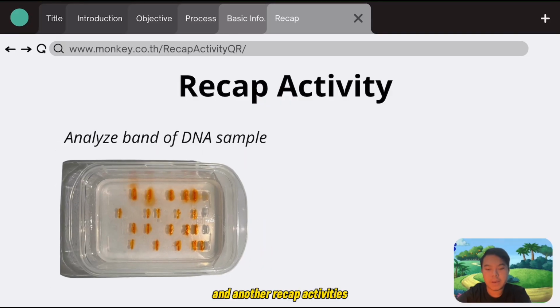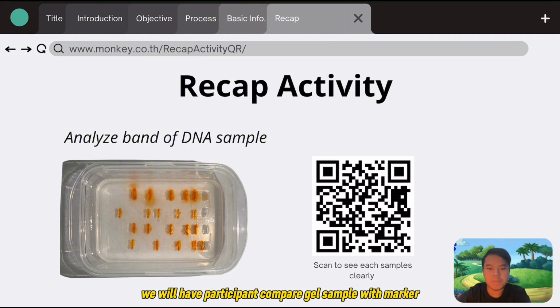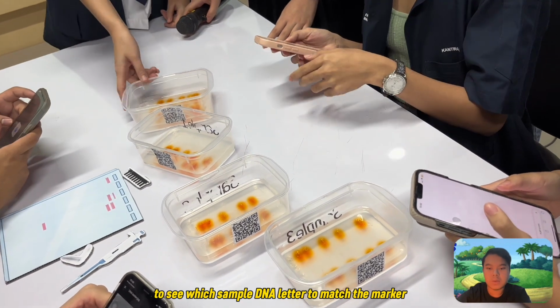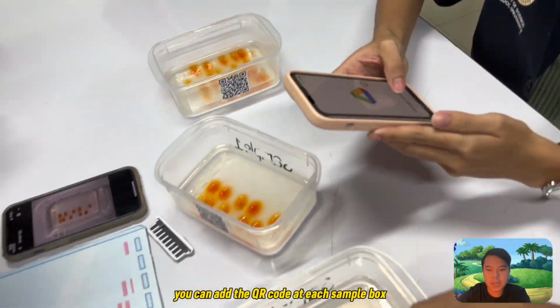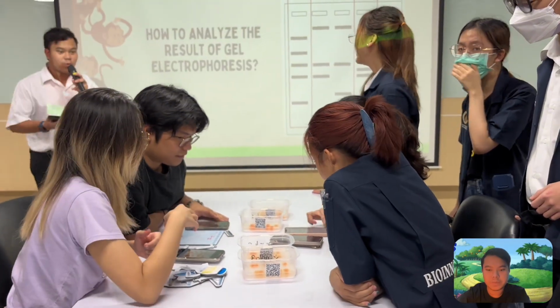And for another recap activity, we will have participants compare a gel sample with a marker to see which sample DNA ladder matches the marker, and after matching, summarize the result. You can add a QR code at each sample box for a clearer sample picture.